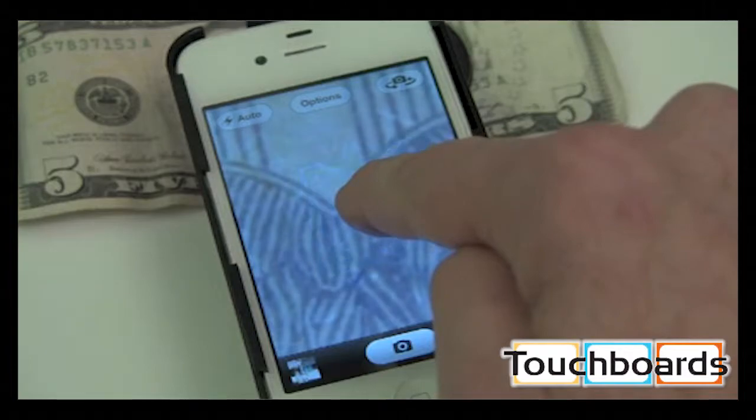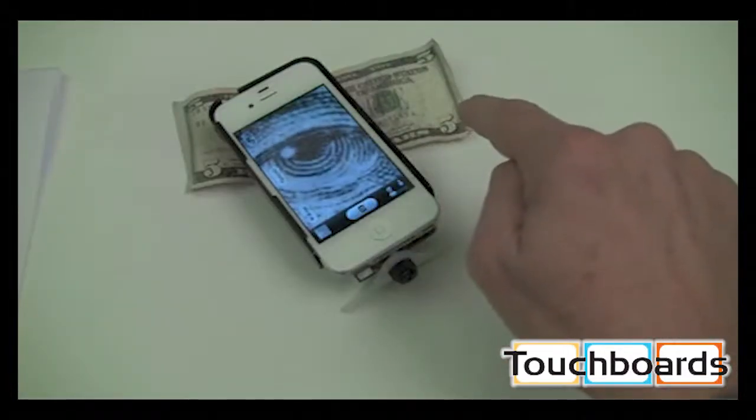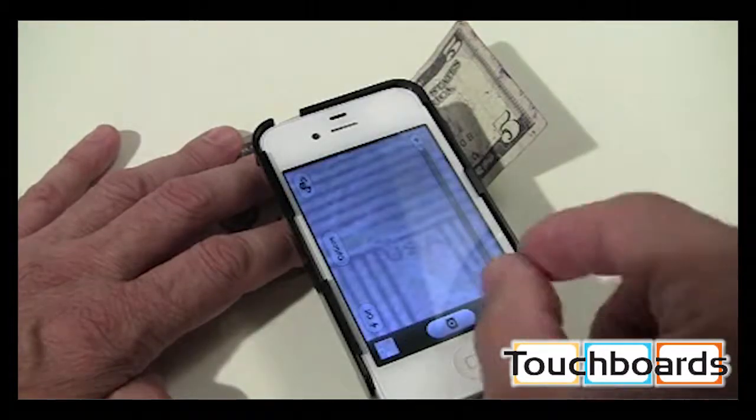Just tap on the screen to autofocus, and tap and hold on the screen for a couple of seconds to lock your autofocus and auto exposure. Tap on the capture button on the screen to take an image.